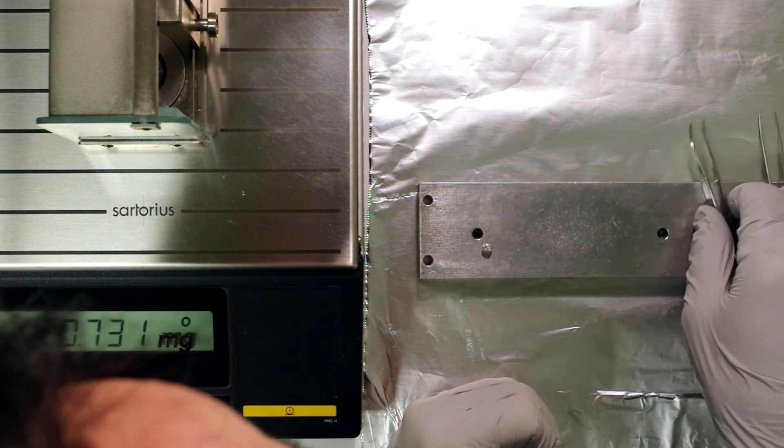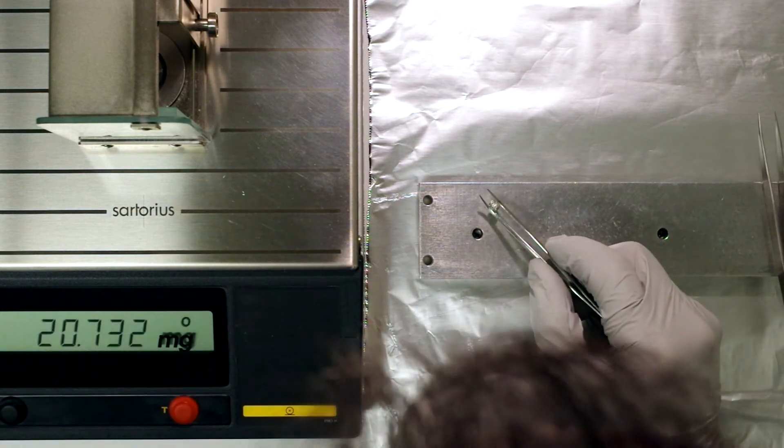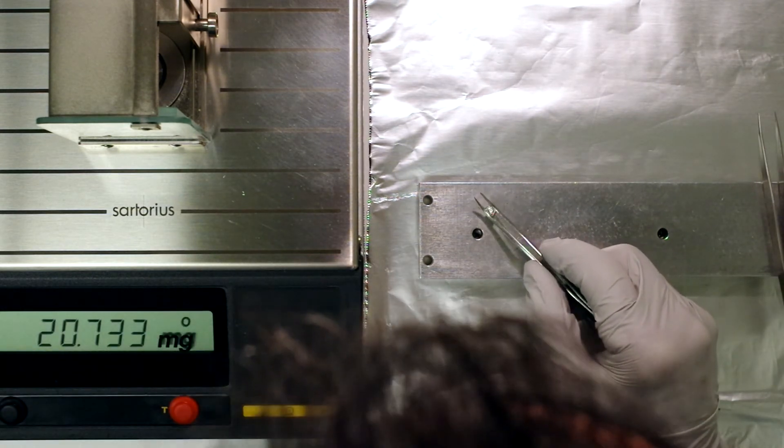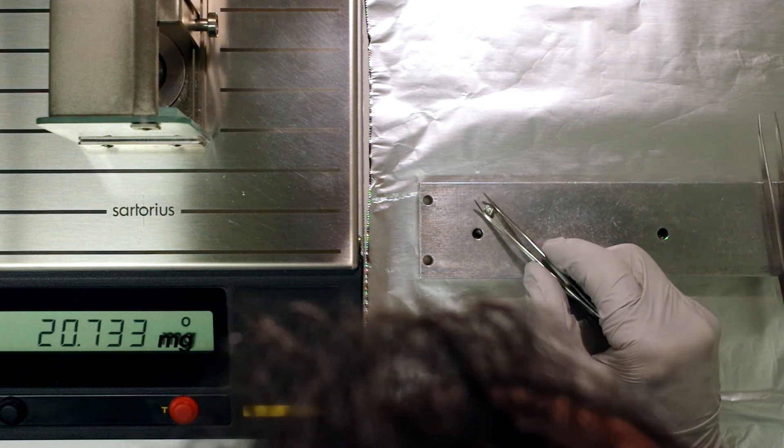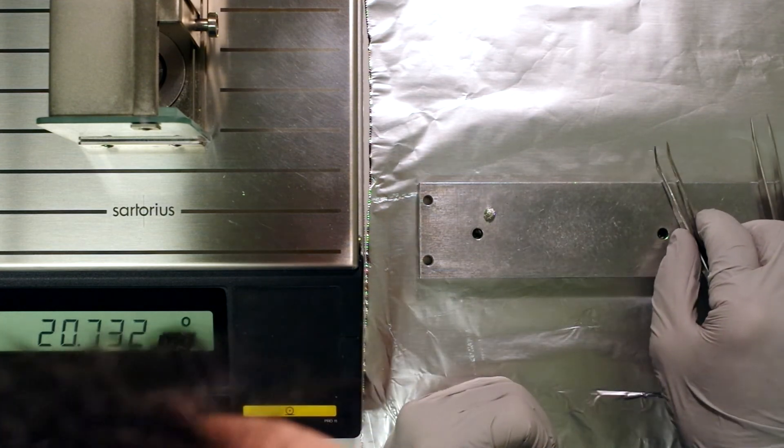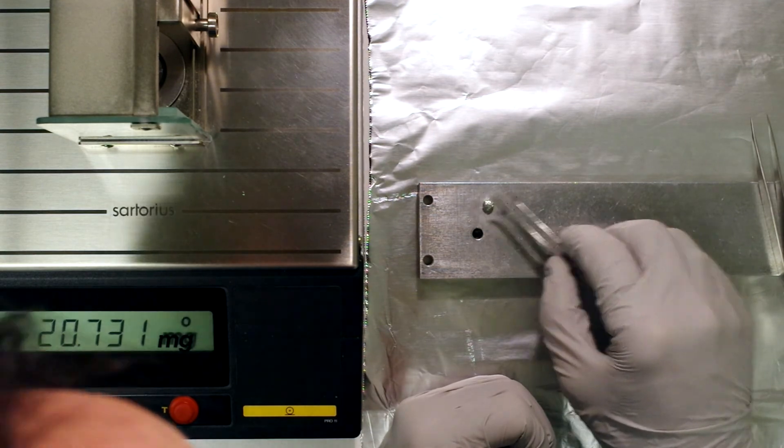And then what I usually do is I tap it against the tray to see if any material falls out. Quite often it does because it's hard to seal these.